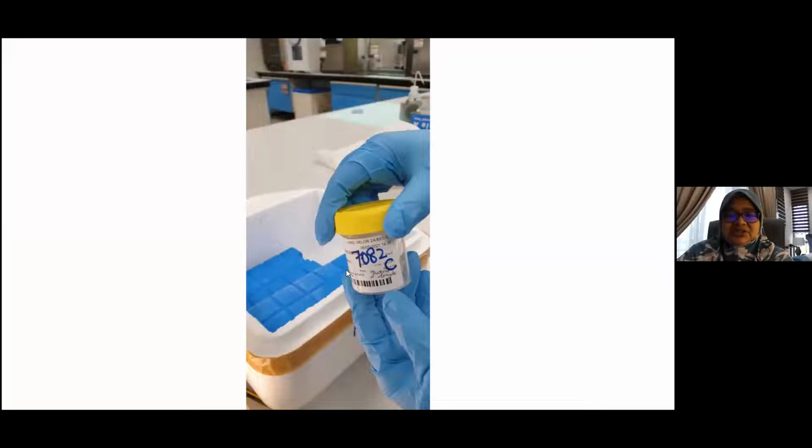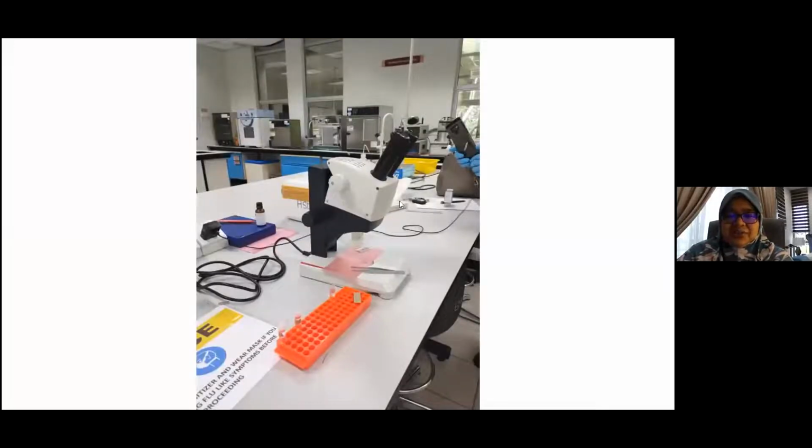The tissue, as usual, is identified, and then we need to use this dissecting microscope. This is a gel pad, and I will put a drop of the buffered glutaraldehyde and place the tissue on this gel pad. Looking down the microscope, I want to identify the area of interest, which is whether there is a glom or not.